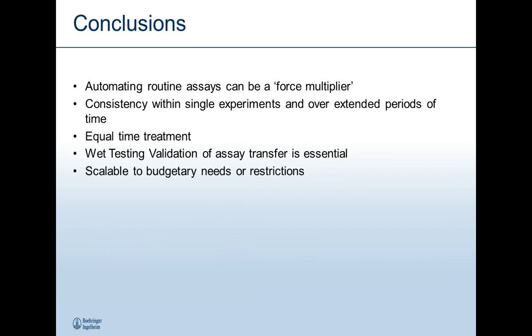In conclusion, just because an assay is routine or basic doesn't mean that it wouldn't benefit from automating the entire or even just a portion of that assay.